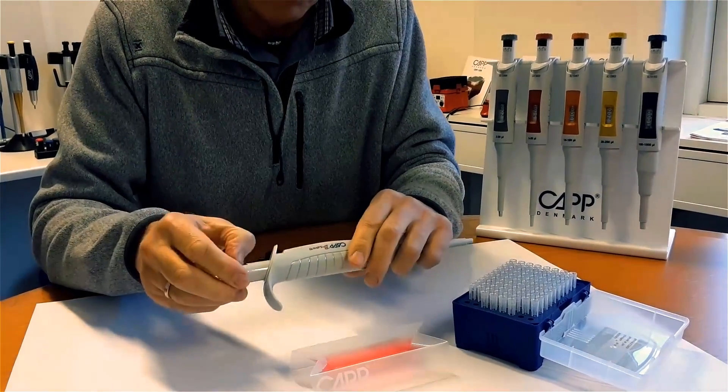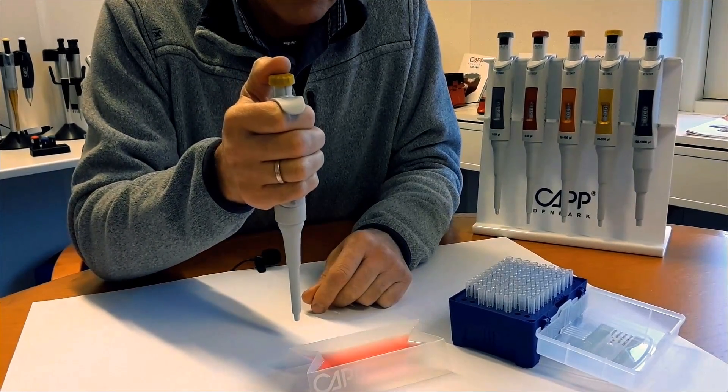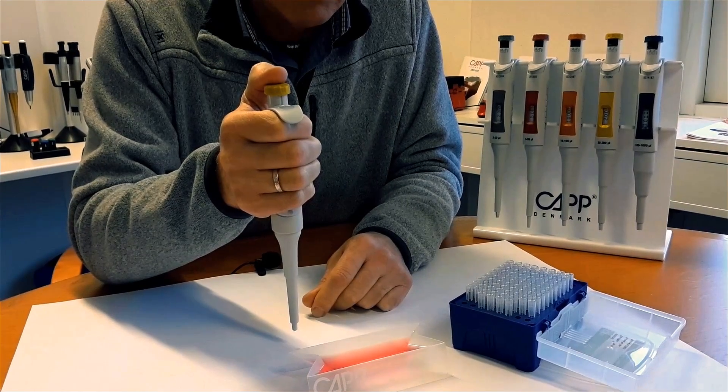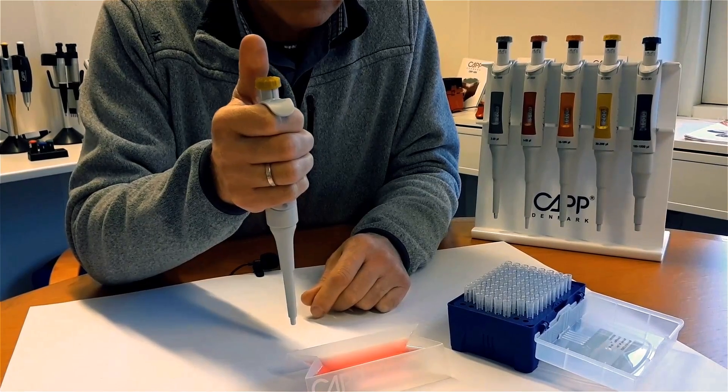Adjust the pipette to the minimum volume and push the plunger once again. Here you should observe that the piston stroke will be very short. This will be a sign that the volume mechanism is working properly. In case of any discrepancy, please contact info at capp.dk.